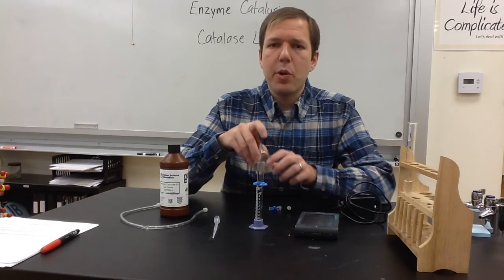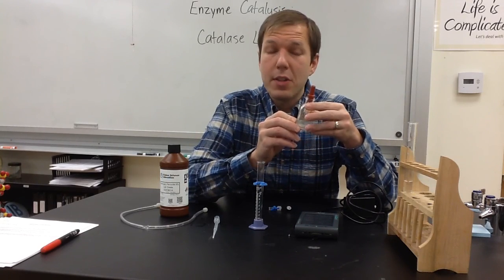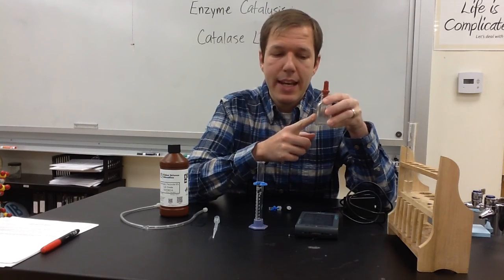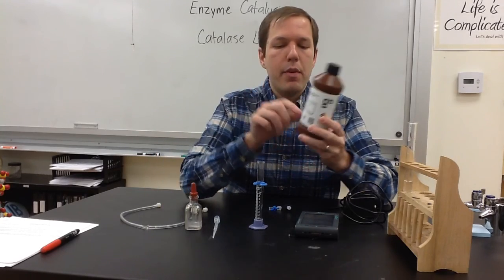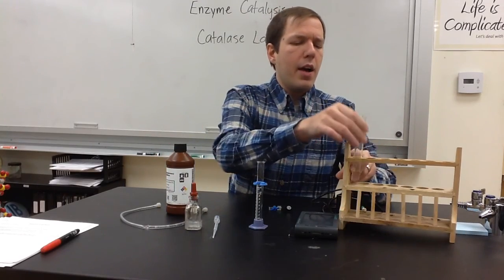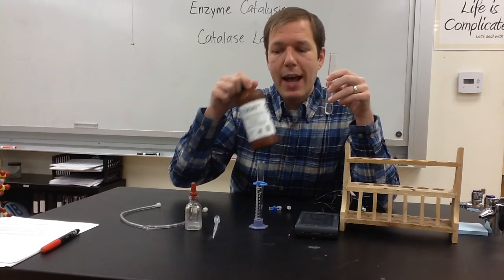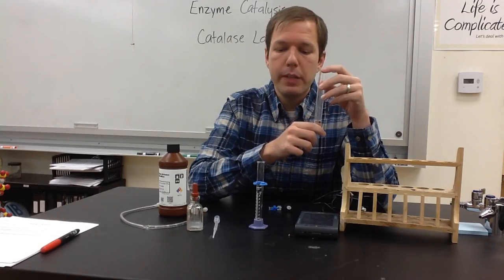The catalase that you're going to get is going to be dissolved. It is water soluble, so you're going to have a solution in dropper bottles that has catalase in it. You will begin by adding some of the hydrogen peroxide, a specific amount, to a test tube. Remember that we'll be dealing with small quantities here. We'll have concentrated peroxide and concentrated enzyme, so we don't need a large volume of liquid.